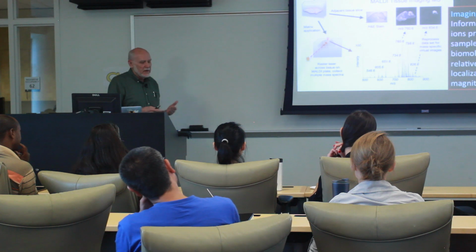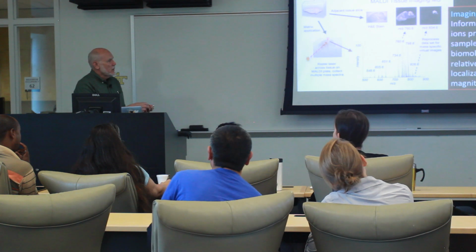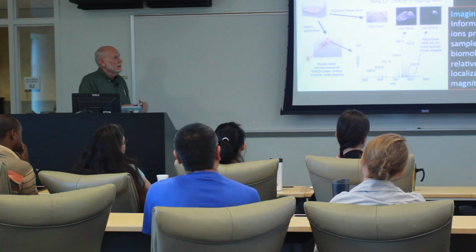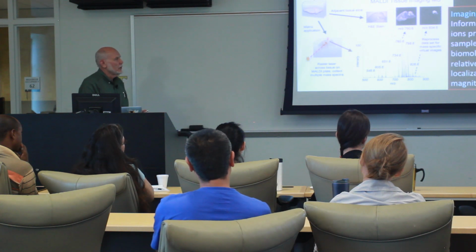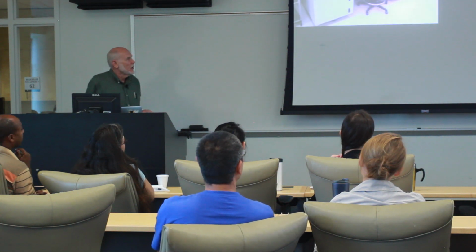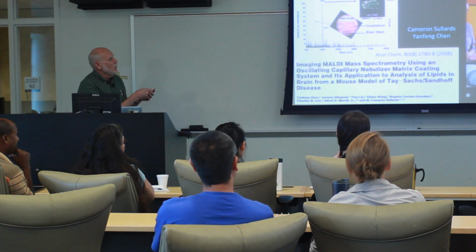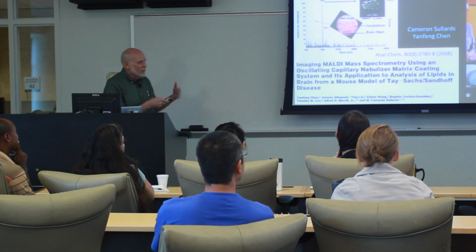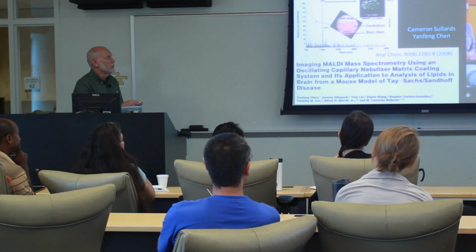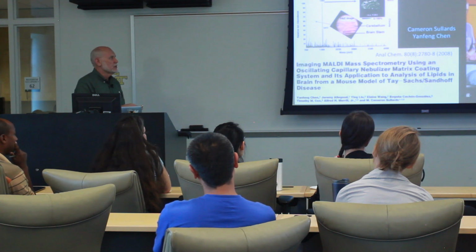And by having instruments that have software that allows you to then work with that data set, you can take the spectra that you collect, decide what ions are of interest, and prepare virtual microscopic images of what the biological material looks like based on that data. So we started off with the Voyager DE star that you've heard about several times before, and basically we're able to do for the first time, not the first time of doing this imaging for brain, but for the first time to image a particular family of molecules in their tissue orientation in this biological sample.